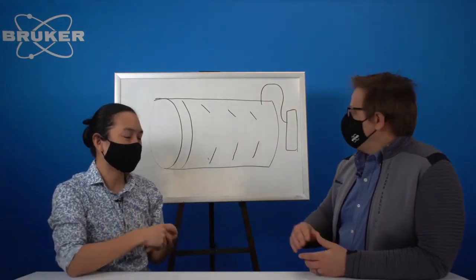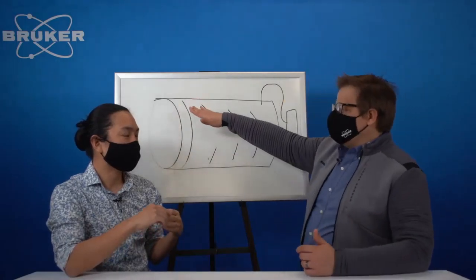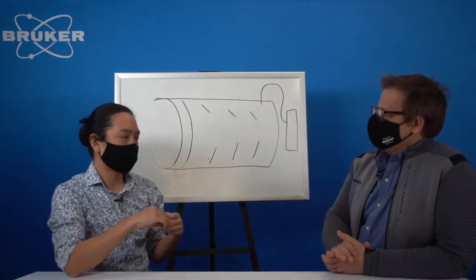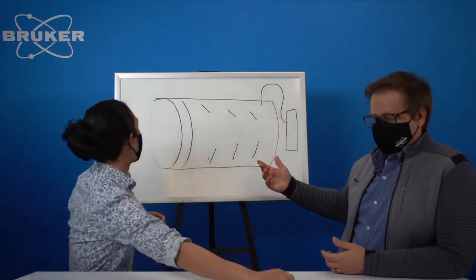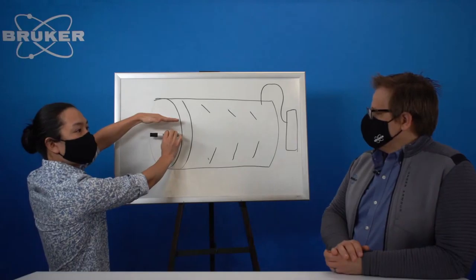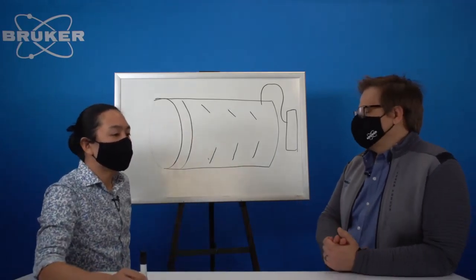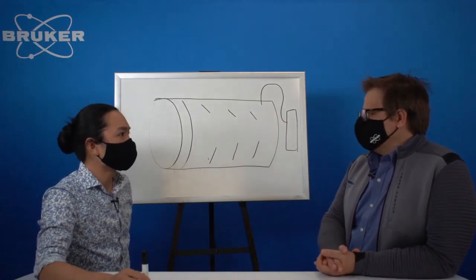In this day, you have one big opening, so we'd have to rely on analog things to condition that signal. To cut it to a smaller area, you would simply put a slit right in front of it that would define the aperture. What size did we typically use? Typically I would use, say, a 0.3 millimeter slit. You could go down to about 100 microns.